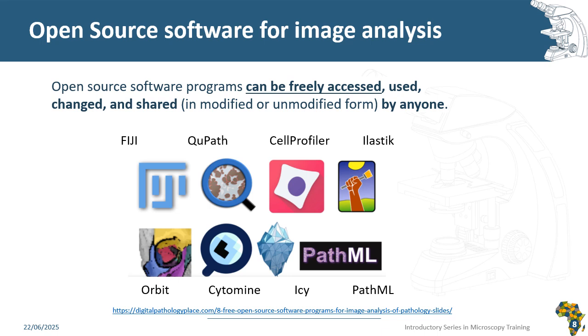There are really a lot of open source free software for image analysis and scientific image analysis. So they are free and open source. You can use them, change them and share them in original or modified form.